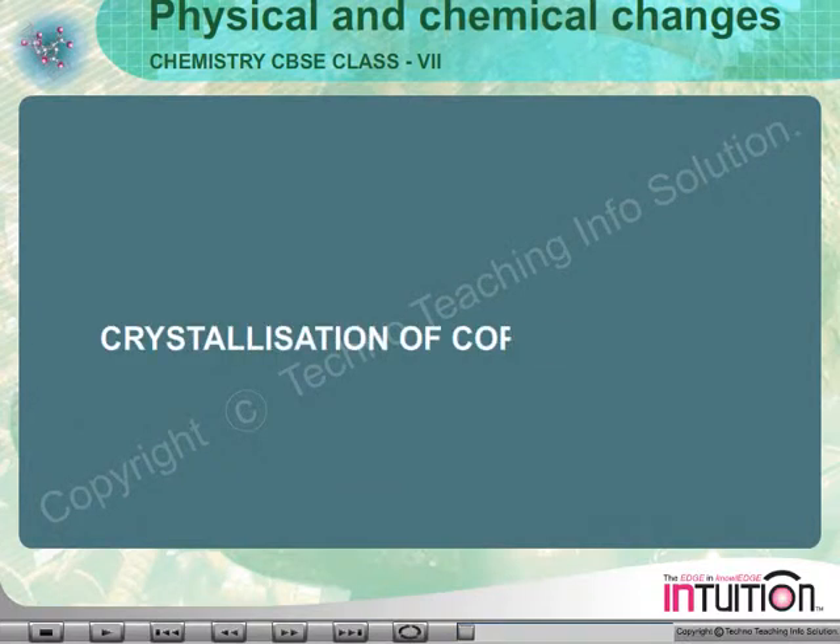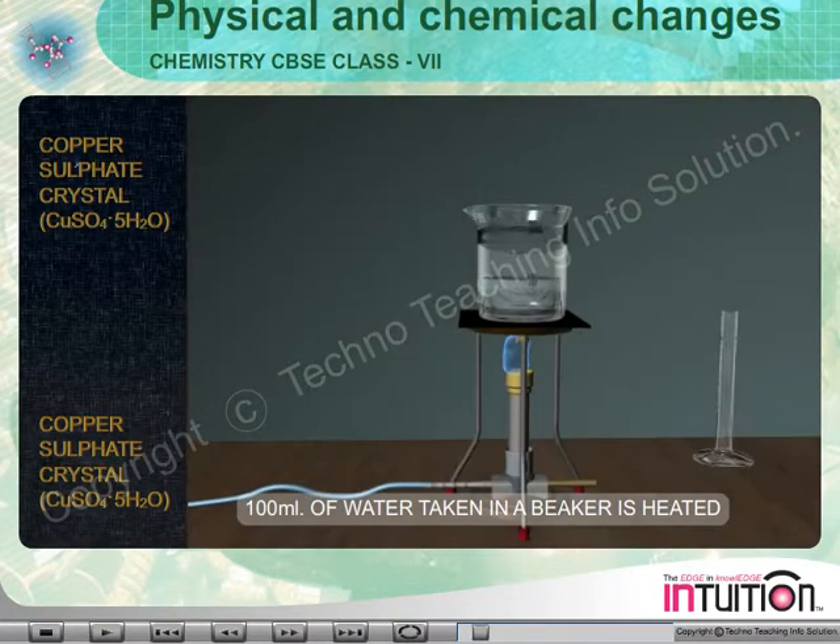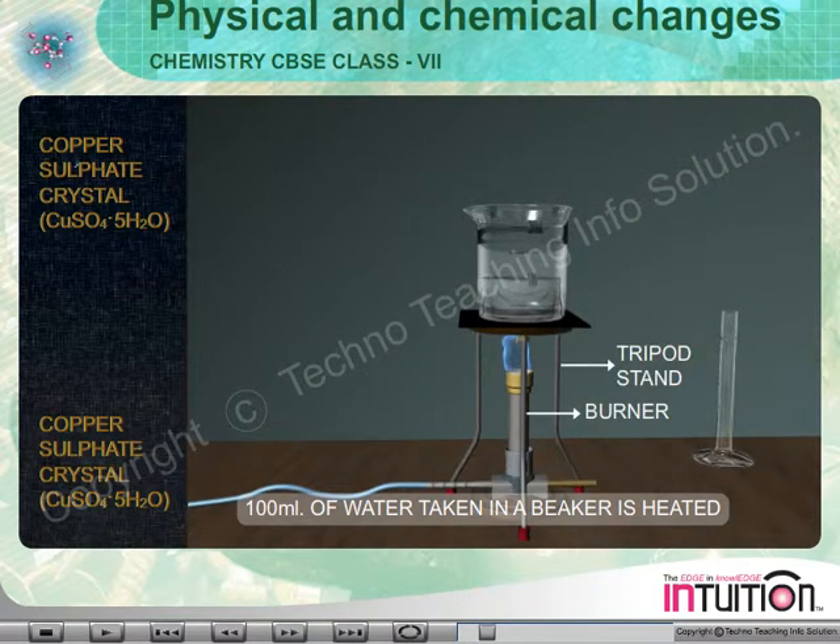Crystallization of Copper Sulphate. We take about 100 milliliters of water in a beaker and heat it on a tripod stand.